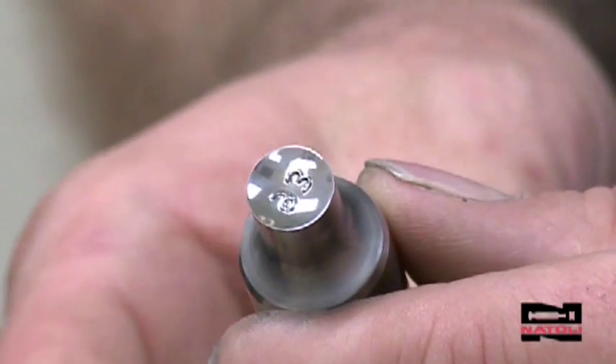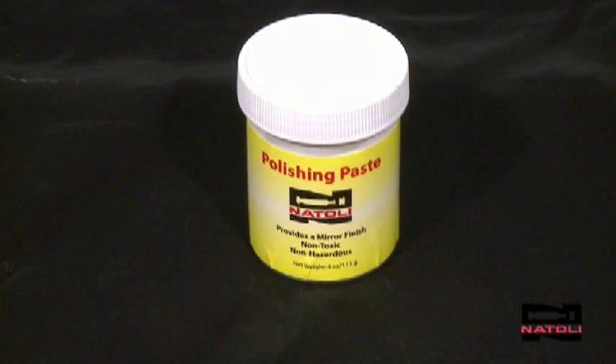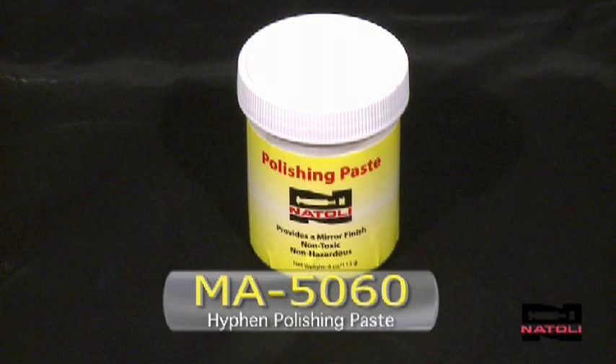Within minutes, this tool is ready to go back into production. Another polishing product known as hyphen paste or polishing paste, part number MA5060, is used for fine finishing.